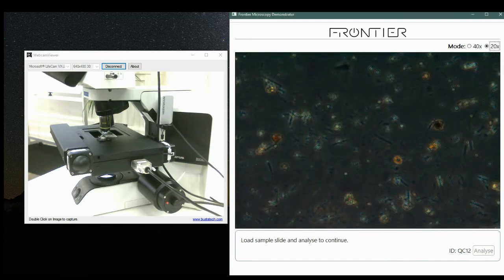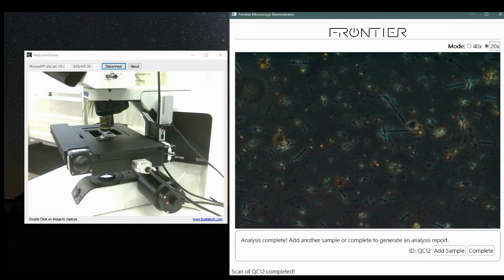Okay, so analysis is complete, and the next step is to go back to the web application and review and generate the report.